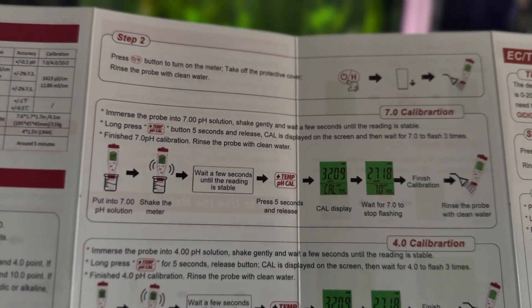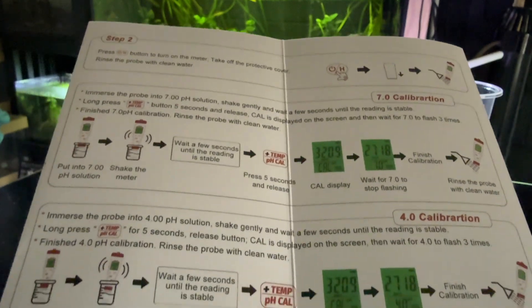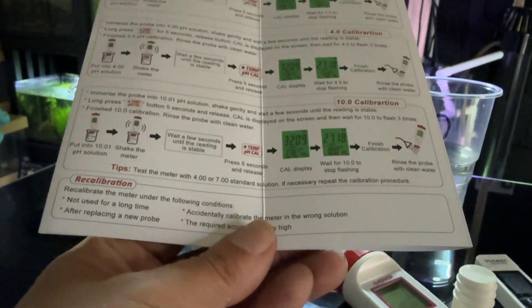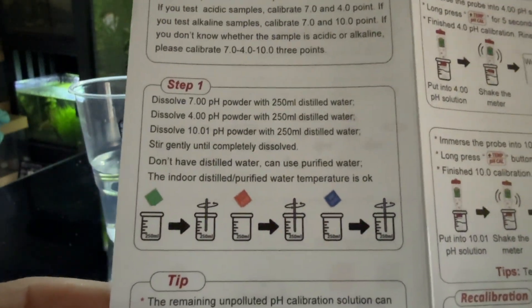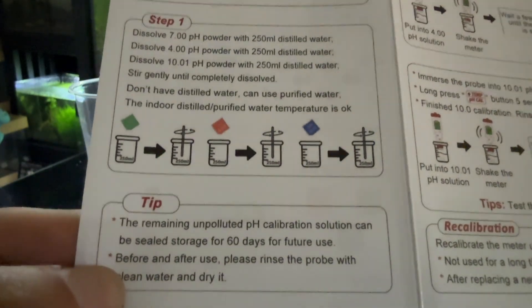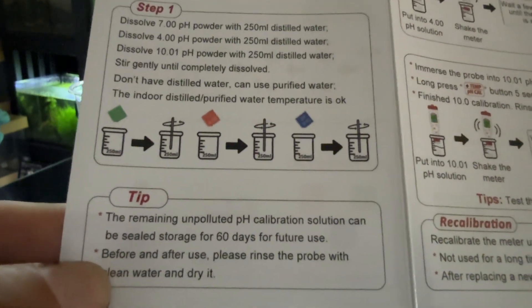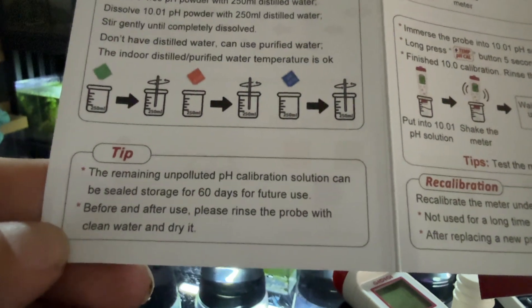But if we were to calibrate it, every little device is going to be different, but there is a step-by-step guide on how to do it. And that's how you would calibrate it. The first step is basically just how to fill up and stir your solutions. Here's a tip: the remaining unpolluted pH calibration solution can be sealed and stored for 60 days for further use. Before and after use, please rinse the probe with clean water and dry it — which I did.